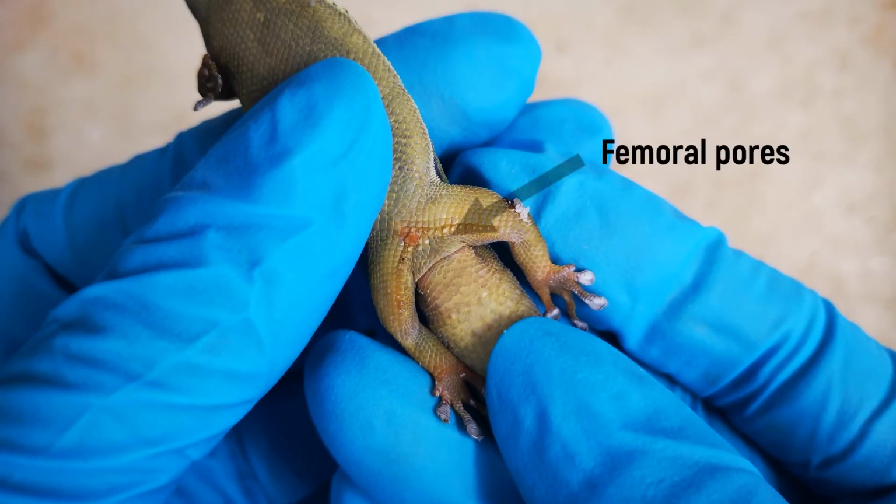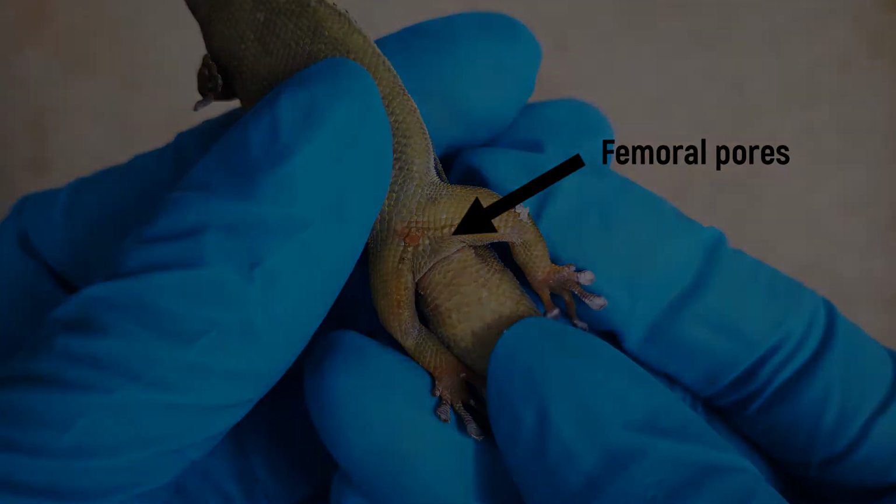Males of many squamate species have femoral pores on the thigh. These secrete a waxy substance that emits pheromones and is involved in communication, especially between the sexes.